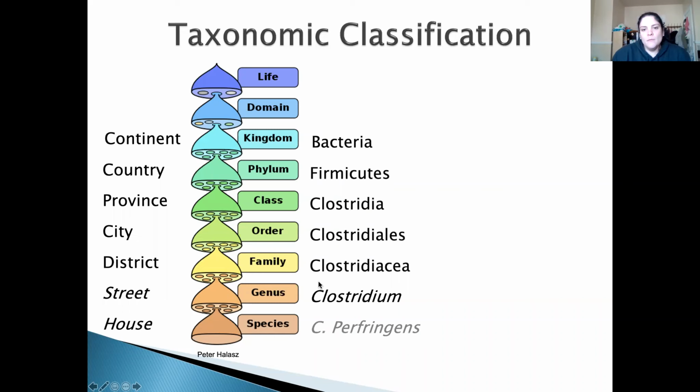We can compare the classification of the bacteria with the address that we need to put on a letter. And when we do the Illumina sequencing, which is the most used for microbiota studies at the moment, what we have is a good, or not as good, but we can work with, classification at the genus level, okay? Meaning that we don't know which species we are talking about.